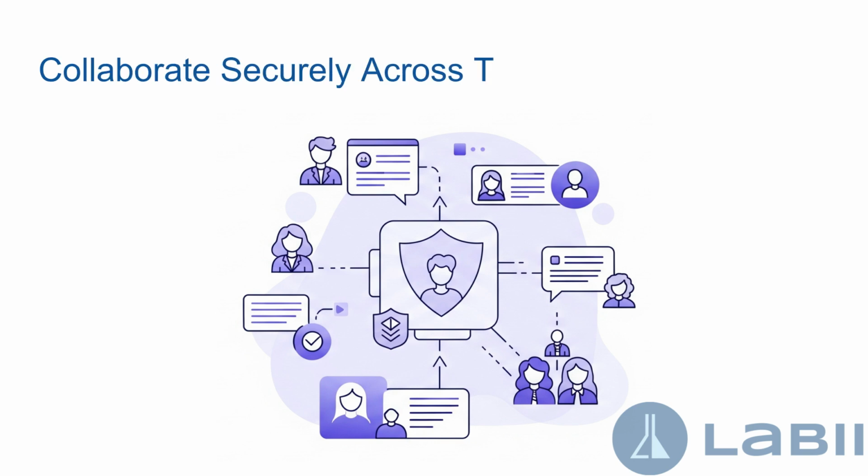Collaborate securely across teams. Enable cross-functional teams to work together on risk assessments. Labii offers role-based access control, threaded comments, and full version history for traceable decision-making.